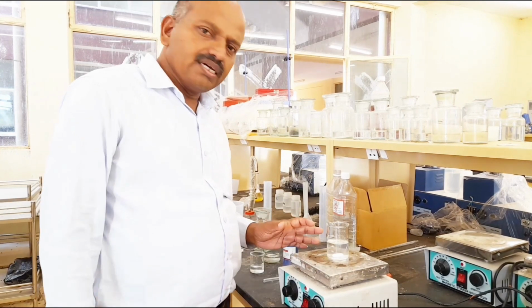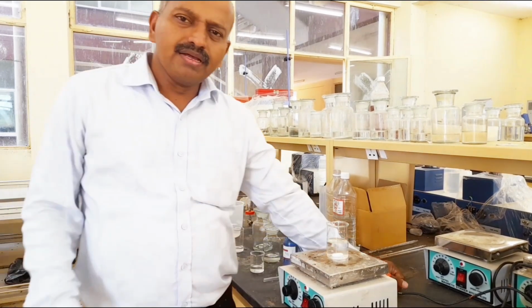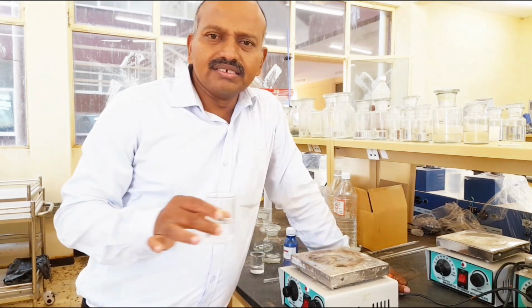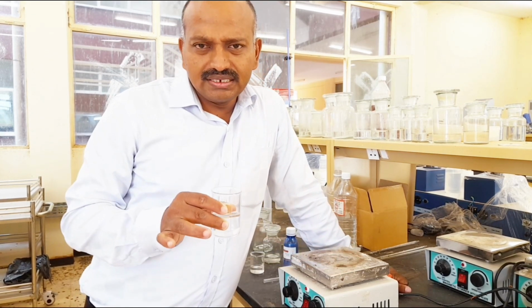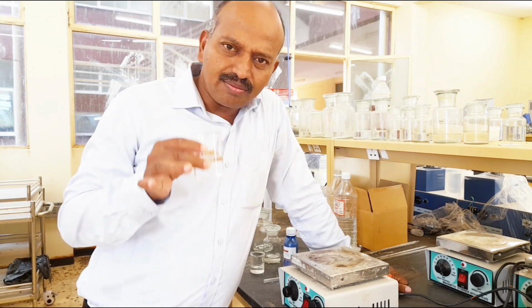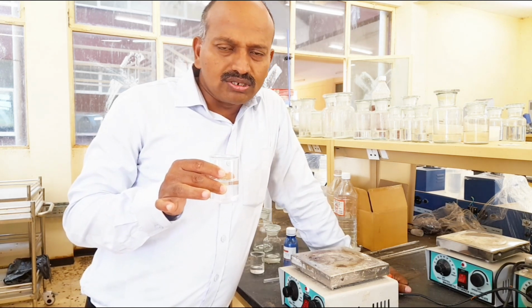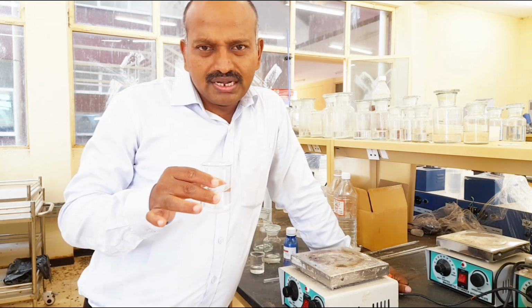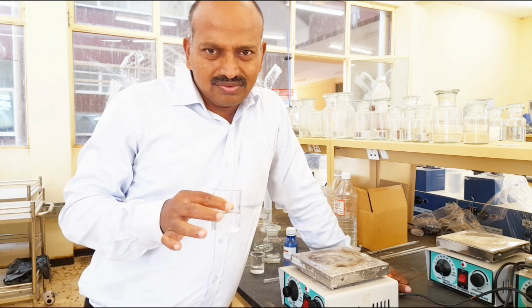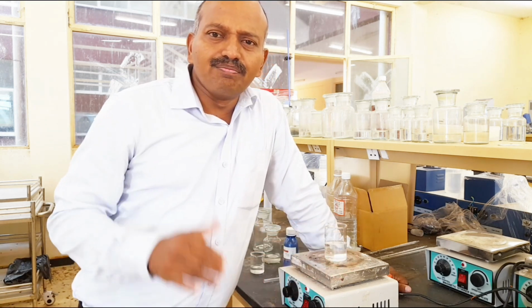Now if you see the mechanism here, the sodium hydroxide present inside the flask, when it reacts with hydrochloric acid, converts into sodium chloride. Already sodium chloride is there in the mixture, and now the sodium hydroxide completely converts into sodium chloride, and the solution is completely neutral. Why does the color change from pink to colorless?